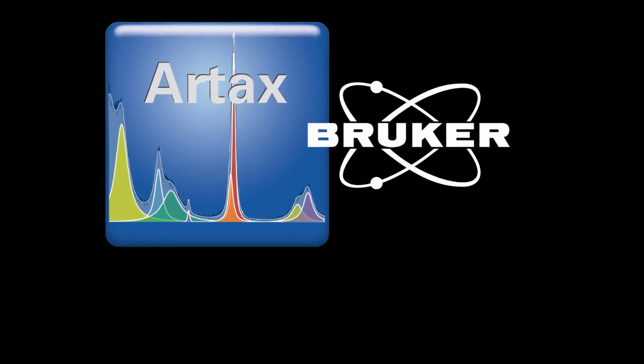Hi, I'm here to explain how to use Artax to acquire and analyze a set of data.